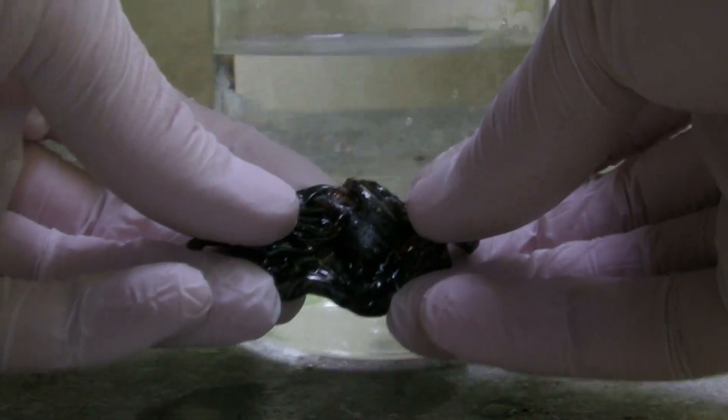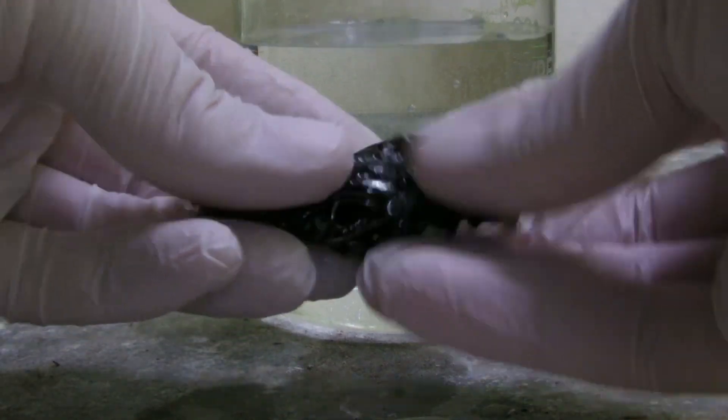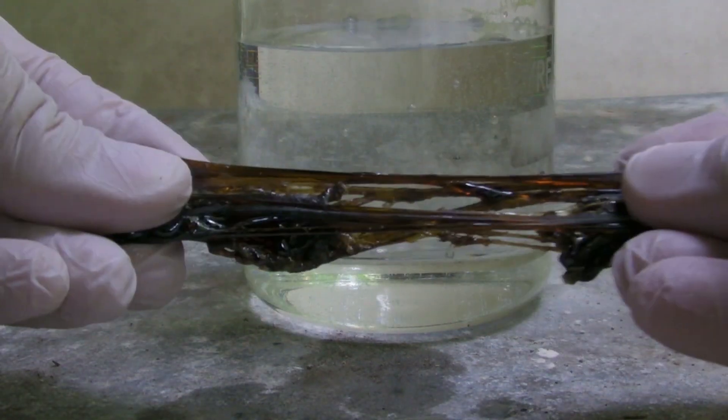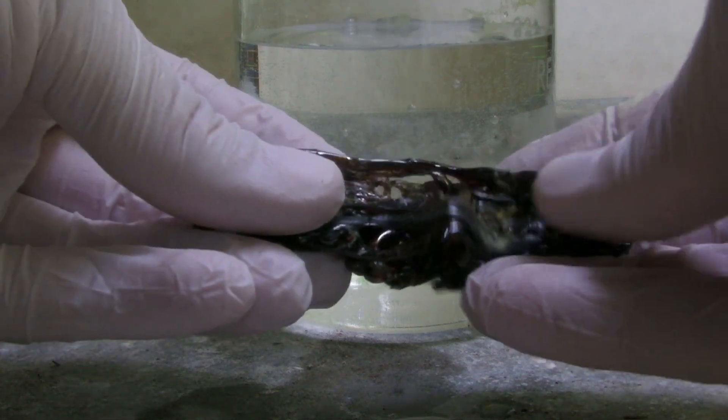Plastic Sulfur has a rubber-like consistency and can be torn easily.